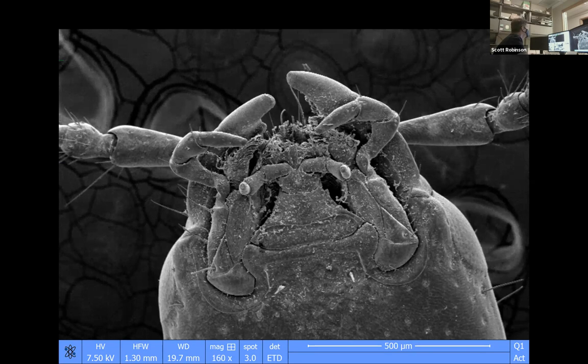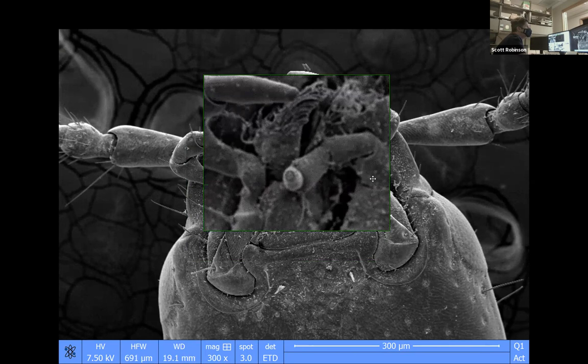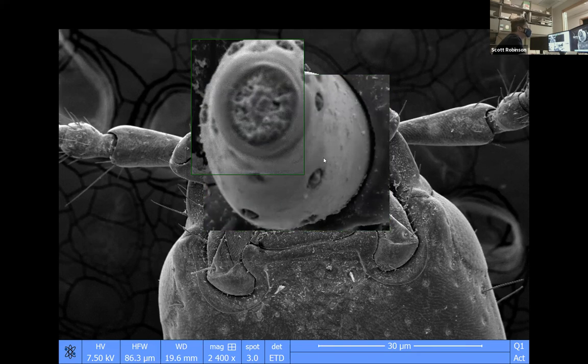Haley in the chat asked if we have a mantis, and I don't think we do, but we do have an ambush bug which has mantis-like forelegs. Maybe we can look at those again at some point after we look at this. Yeah, I wish we had a mantis. They're so cool. Yeah, but they tend to be larger. We're limited in space when we put on these plates. So you're going to have to get an immature mantis that died before its time to put on there. Usually you don't notice the mantis because they're camouflaged until they're larger. So you don't get those as much, I don't think.